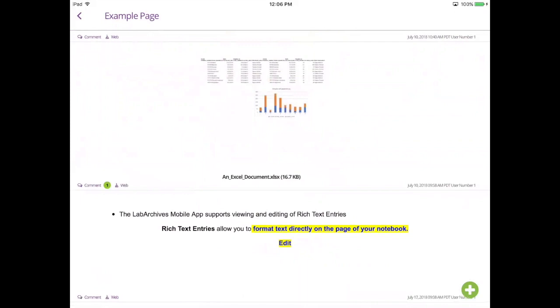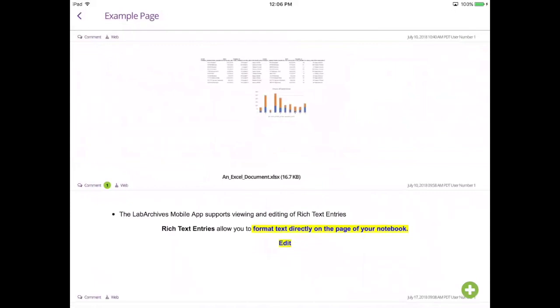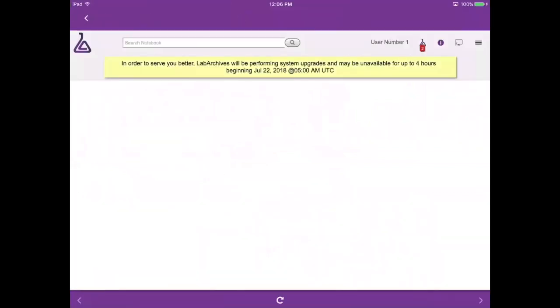You can communicate with your team by adding comments to an entry. To add a comment, tap comment. And to view an entry in the web app, tap web.